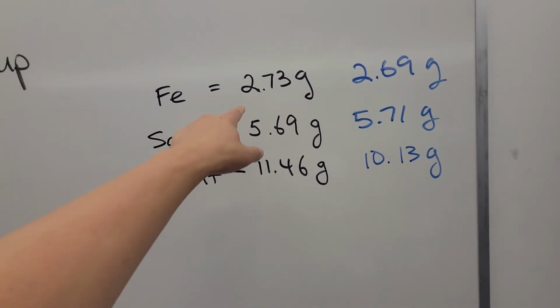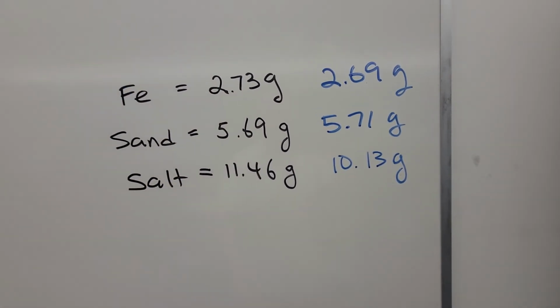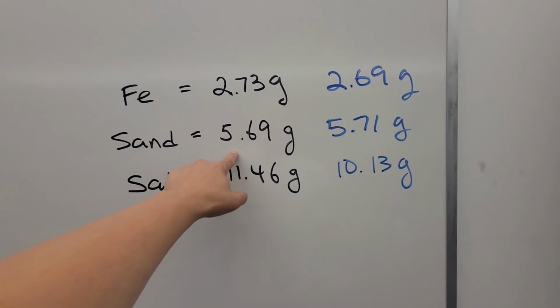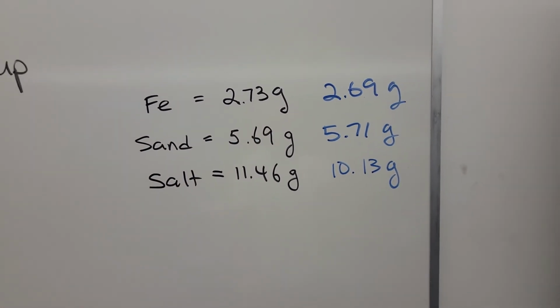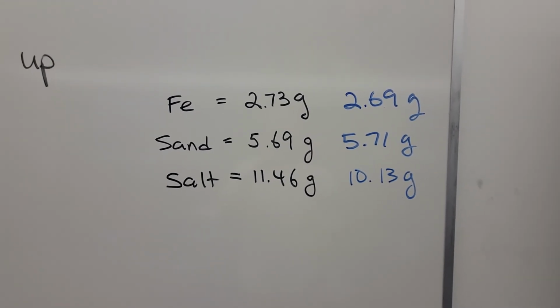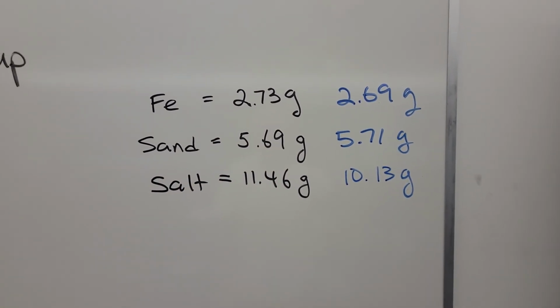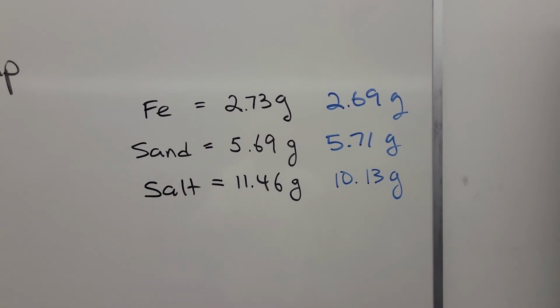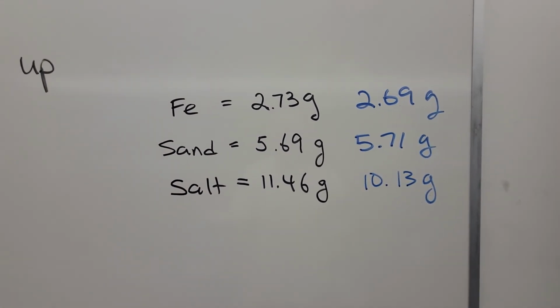What I mean is, I know I didn't get all the iron out, but I did get a little bit of sand in there. And over here, I almost nailed that one. But again, that might not mean exactly that I did really well, but it could have gotten really close coincidentally because maybe some salt got in there and some of the sand got into the iron mix.